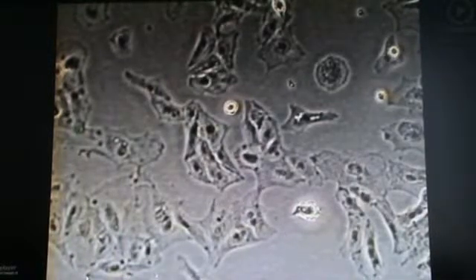This connective tissue culture was filmed using the phase contrast method. The Ergonome technique, using a higher magnification, allows the cell cores and granulation to be clearly recognized. This living culture can hardly be assessed with normal bright field illumination. The Ergonome grey field technique allows you to clearly resolve all the structures with increased contrast and a convincing image depth.